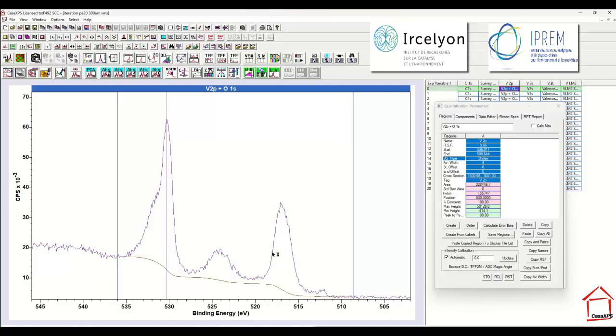If we don't get that 2:1 ratio, we have to question any peak model. So we can't ignore physics. The physics suggests that for a doublet peak that's a p orbital, we ought to have a 2:1 ratio or thereabouts. And if we don't obtain that, then we know we've done something wrong. So this Shirley background looks like it's making it possible to have that ratio that's required.